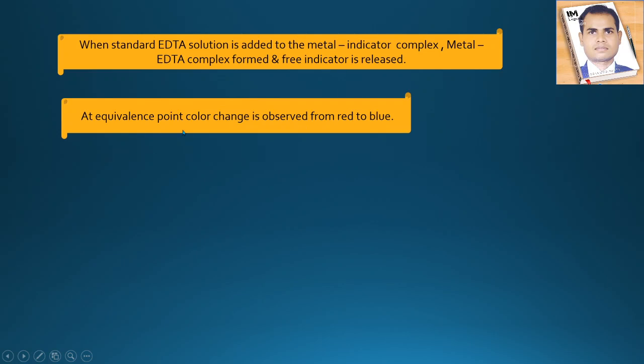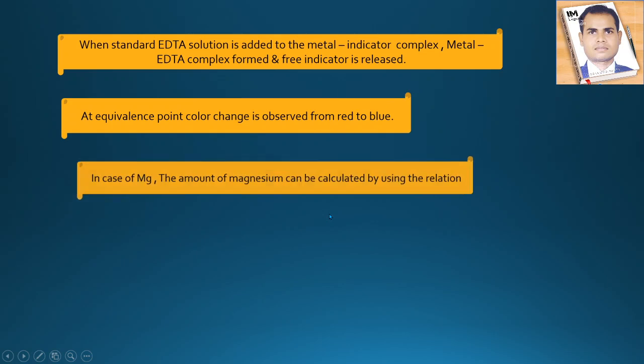At the equivalence point, a color change is observed from red to blue. That is the end point of this complexometric titration.